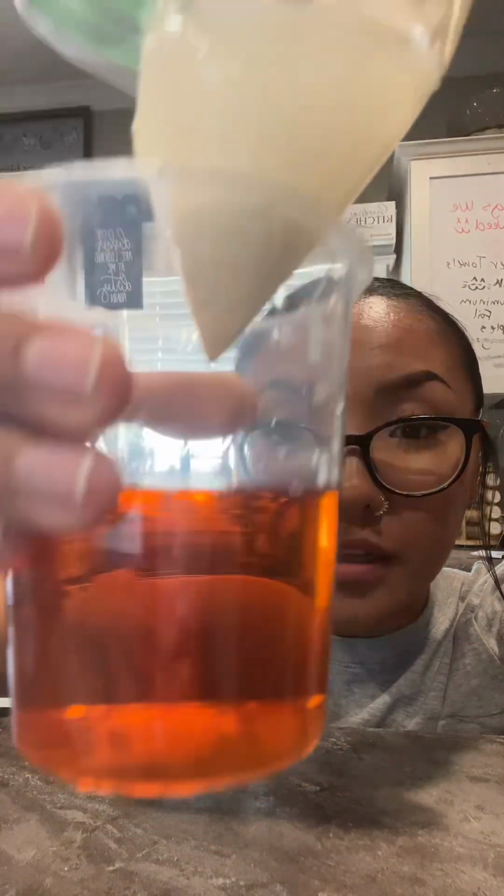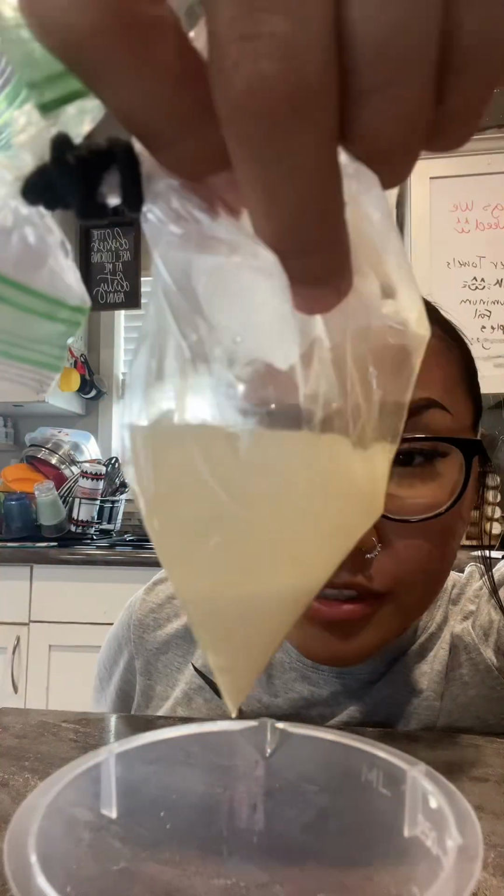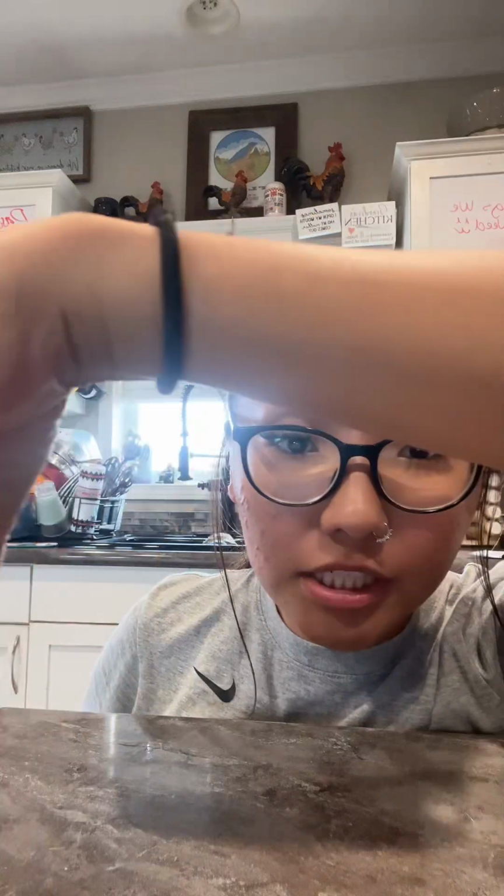It's still this color. But yeah, what was it called? The cornstarch solution didn't go through the bag. So I'm going to write that down for my observation.